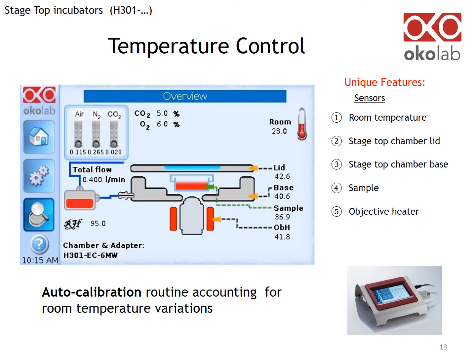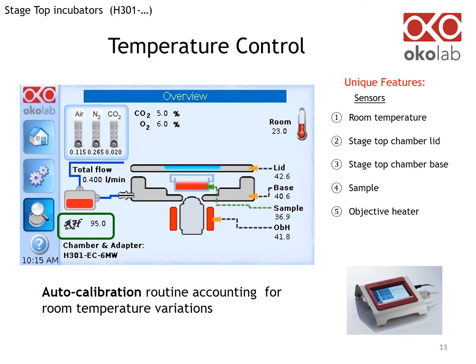You can see all parameters on the touchscreen display. There are multiple sensors: one monitors room temperature, others control the temperature of the stagetop chamber lid and base, the sample if you're operating in sample feedback mode, and the objective heater if you're using one. In sample feedback mode, simply place the provided thermocouple in a reference well — this will ensure accuracy of 0.1°C from the set point, regardless of room temperature fluctuations. The same display shows relative humidity, gas concentration of individual gases, as well as gas flow rate of individual gases and total gas flow.